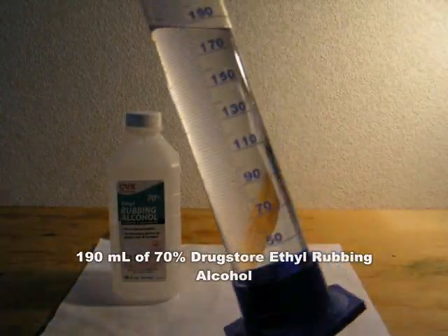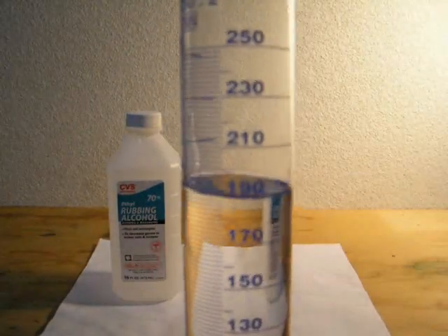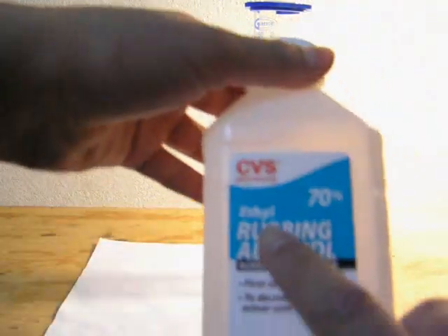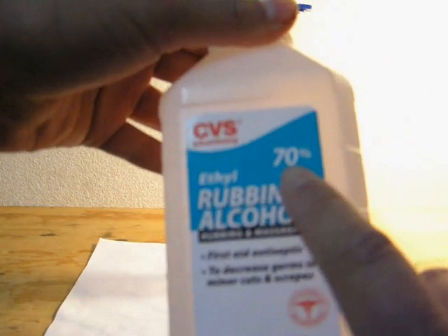Here I have about 190 milliliters of drugstore ethyl rubbing alcohol. Check the bottle and make sure it's ethanol, not isopropanol. Preferably, the concentration of ethanol should be 70% or higher.